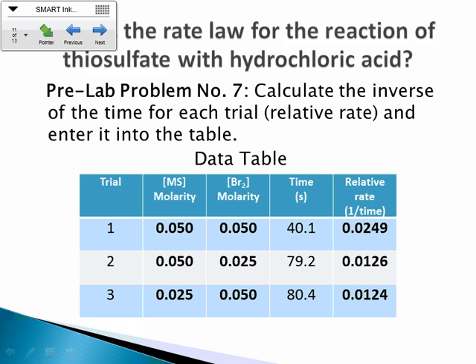And then what we want to do is find the rate law, okay? So here's where I think maybe the way that I explain this is a little bit easier than the way that they explain it in the book. And I would go with my method if I were you, because I just think it's easier. What you want to do is find a couple of experiments here where the concentration of one of the reactants doubles and the other one stays the same.